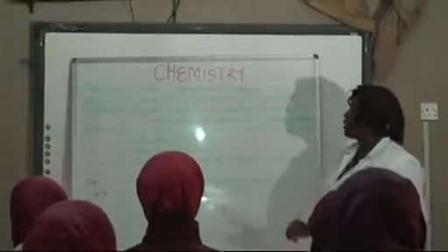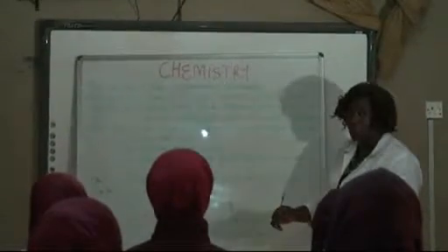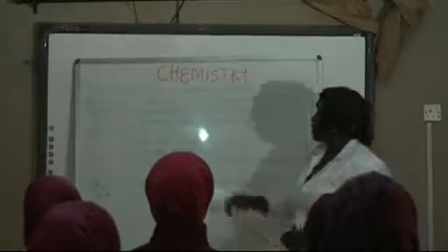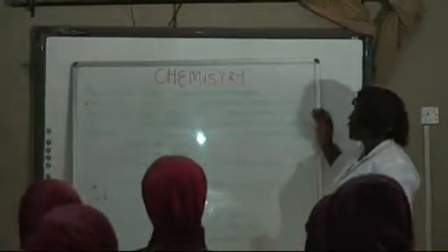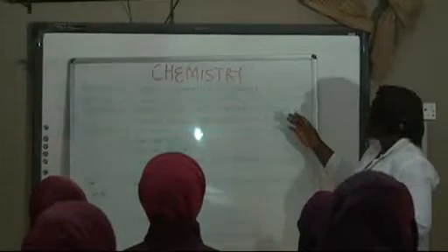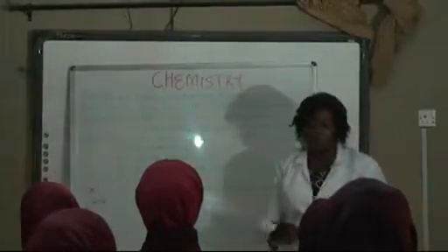On the board we have the soil and sand, which is the one that you have mixed with your sodium chloride, that's your salt. We also have the distilled water. In your apparatus we have the funnel, we have the conical flask, we have your beaker, then we have evaporating dish, the Bunsen burner, the wire gauze, tripod stand, and filter paper. Now the procedure here will show you how we are going to do this practical.